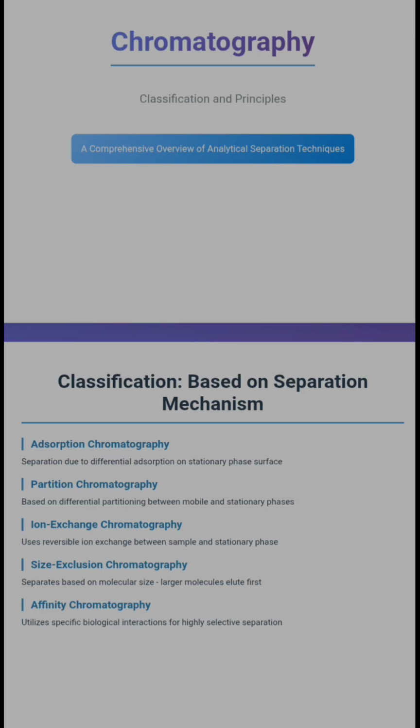Fourth, size exclusion chromatography separates based on molecular size. Larger molecules elute first. Affinity chromatography utilizes specific biological interactions for selective separation.